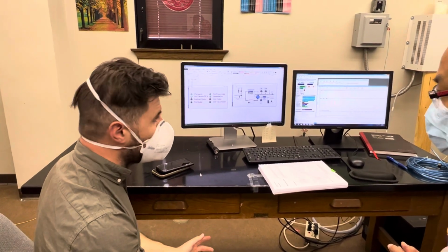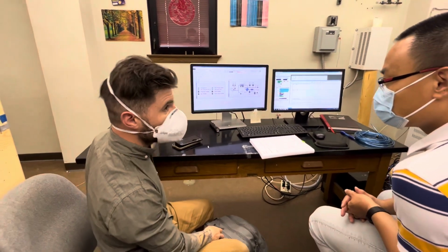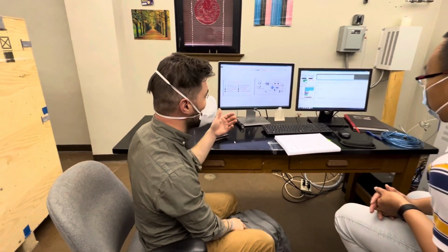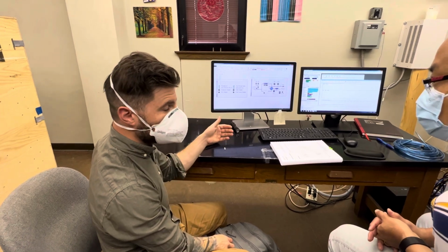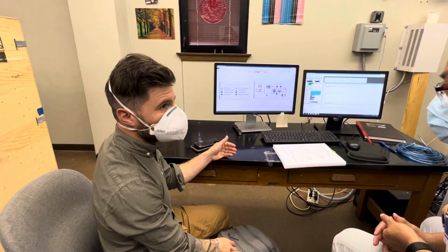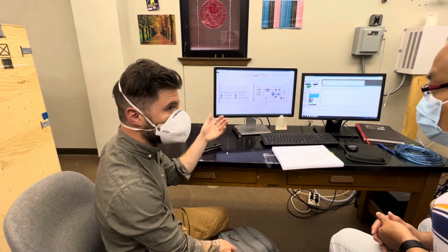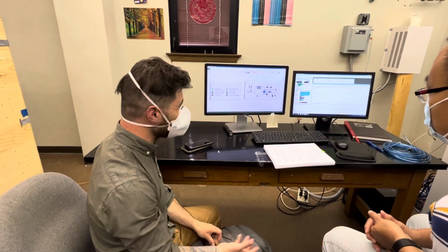Because I had realized at some point that everything was increasing slowly, but increasing over a few months. Like, oh, I guess there's a leak in my system. That thought never crossed my mind because it was happening so slowly. Argon one day was 18 millivolts, and 2 weeks later it might have been 20, and 2 months later it was 24. But because it was happening so slowly, I didn't get it until I plotted it. And whenever I plotted it, it was like, oh, we're leaking, but slowly.